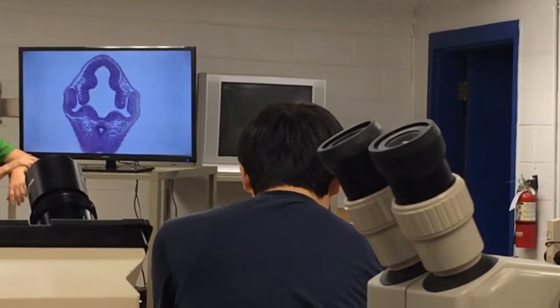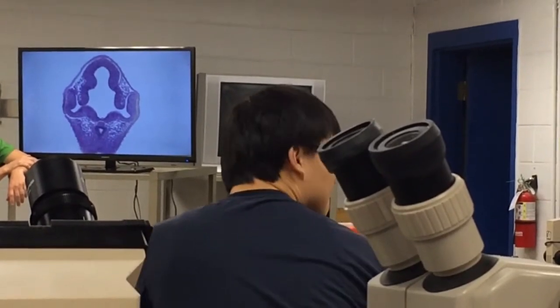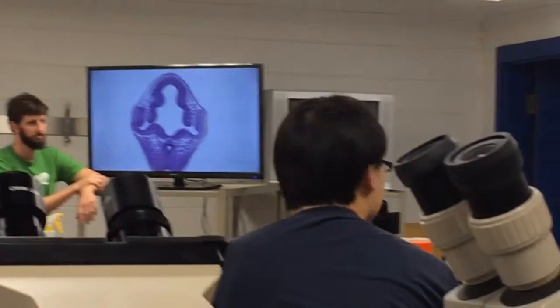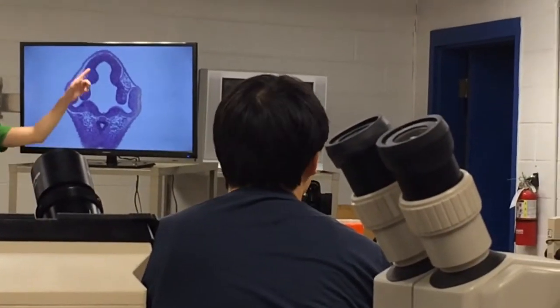Look at me. Look, look. The brain bends down. Look at the drawing. It bends down. So if the knife blade passes through it in this manner, you're going to see midbrain, forebrain.